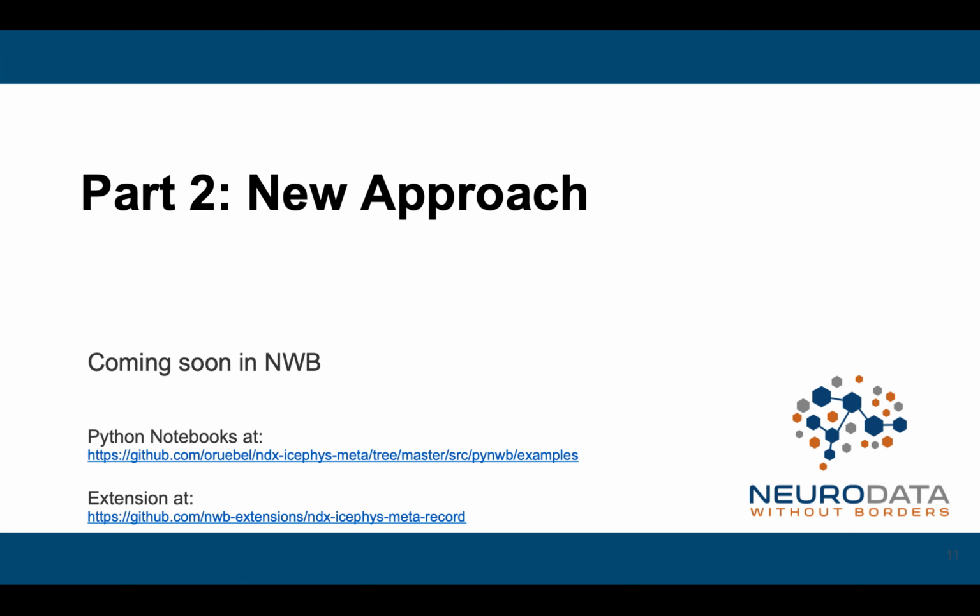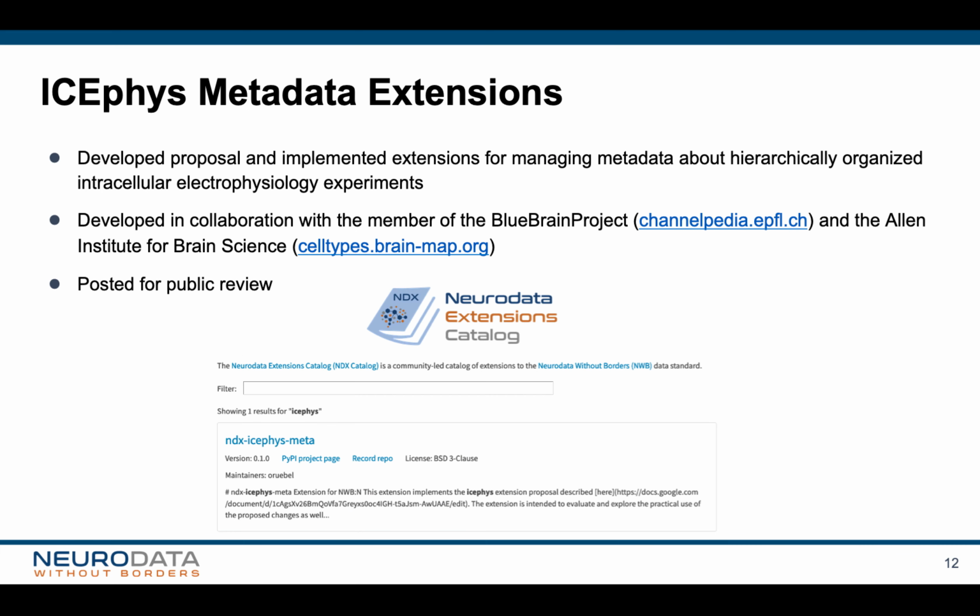And so to address these open challenges, we have been working with the community over the last roughly 9 months with a goal to enhance the management of intracellular experiment metadata. These capabilities will become available in NWB soon, so we wanted to give you here a preview of what is coming soon.